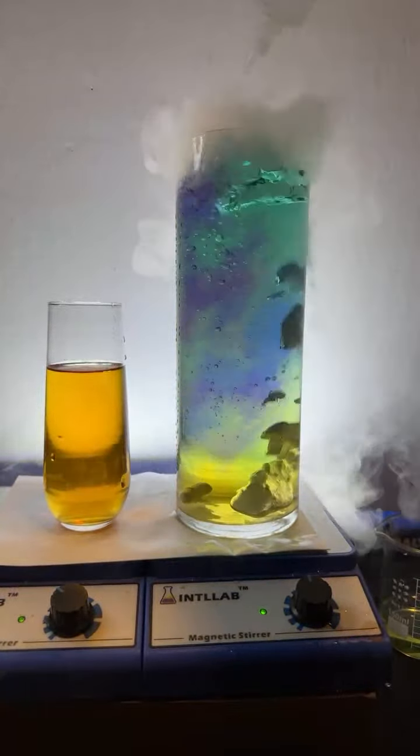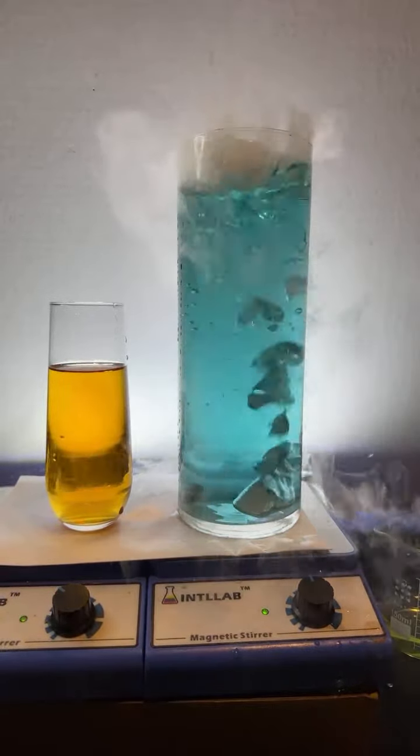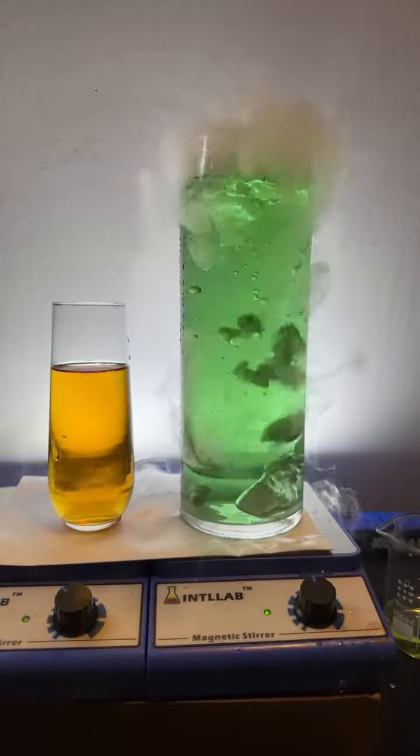Here, I'll add a little bit more base in there. You can see it. I'm adding the base, and as the carbon dioxide bubbles through, it neutralizes it, and then it makes it acidic.